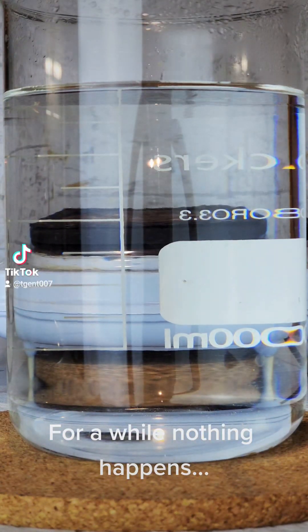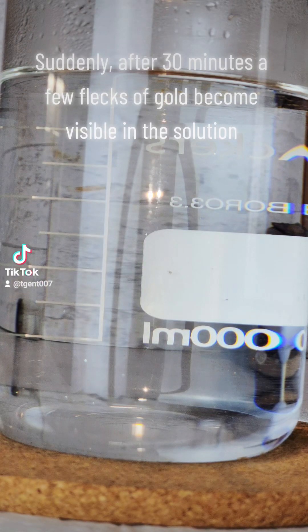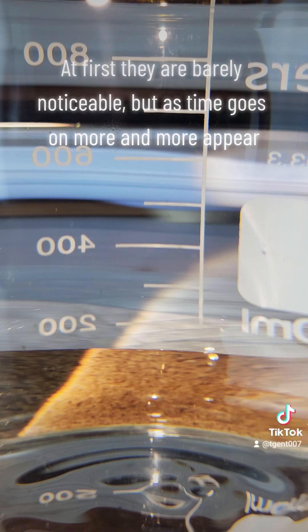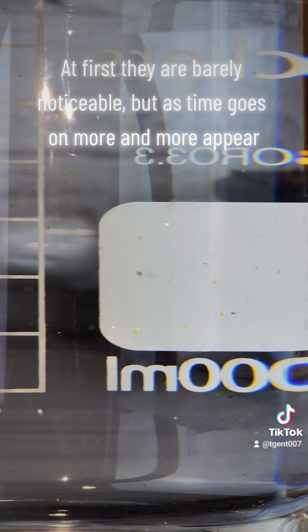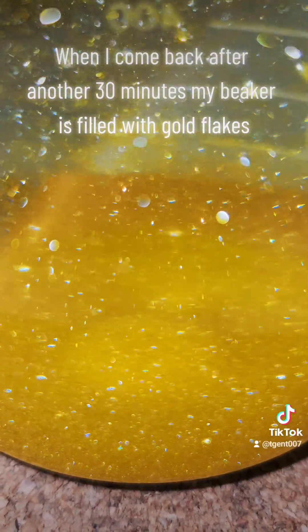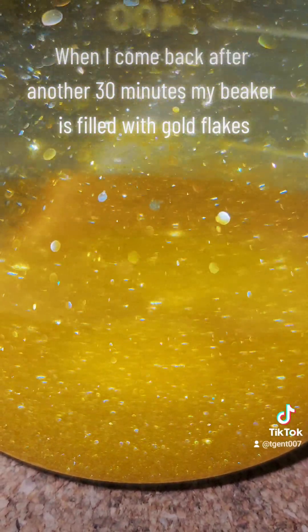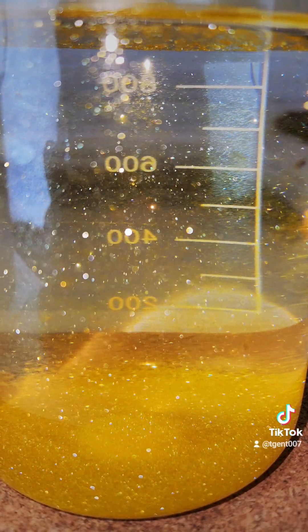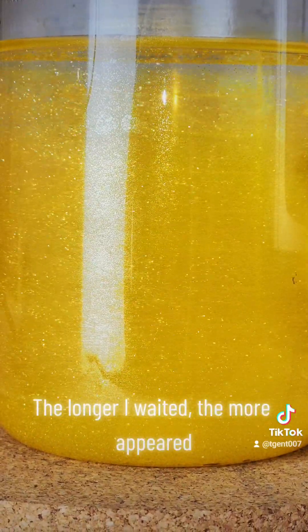For a while nothing happens. Suddenly after 30 minutes a few flecks of gold become visible in the solution. At first they are barely noticeable, but as time goes on more and more appear. When I come back after another 30 minutes my beaker is filled with gold flakes. Watching them rain down was surprisingly relaxing and beautiful. The longer I waited, the more appeared.